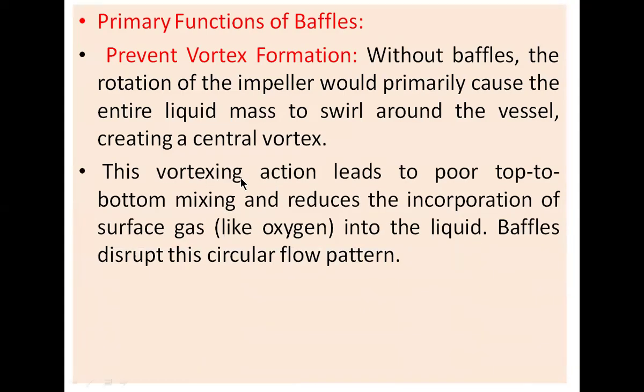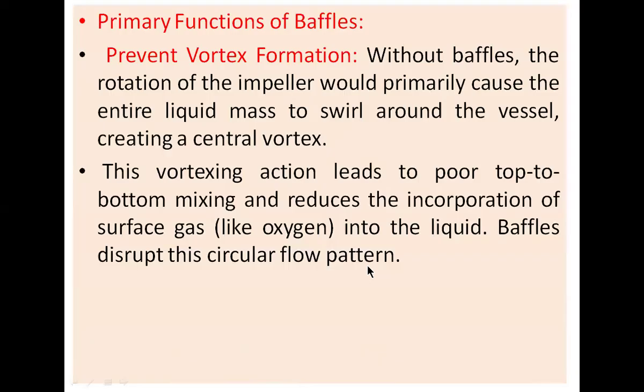This vortexing action leads to poor top to bottom mixing and reduces the incorporation of surface gas, that is oxygen bubbles, into the liquid medium. That's why these baffles are kept on the inner wall of the fermenter vessel. Baffles disrupt this circular flow pattern uniformly. I hope you understood this primary function of the baffle, that is to prevent the vortex formation or the swirling.